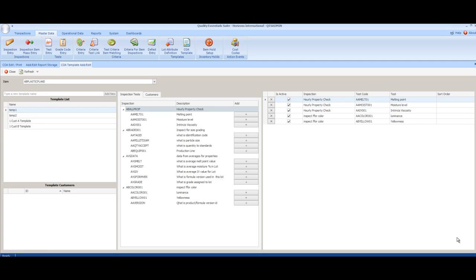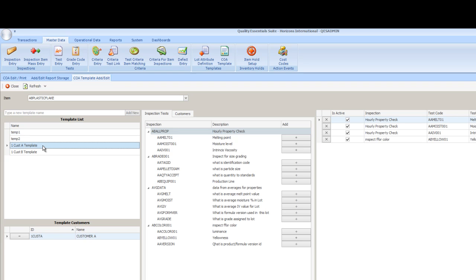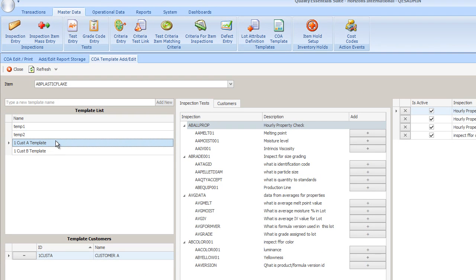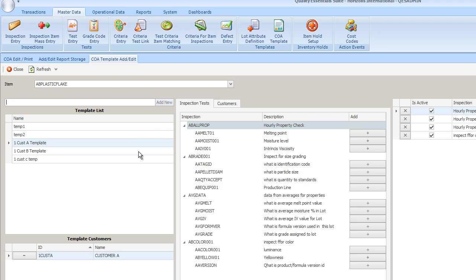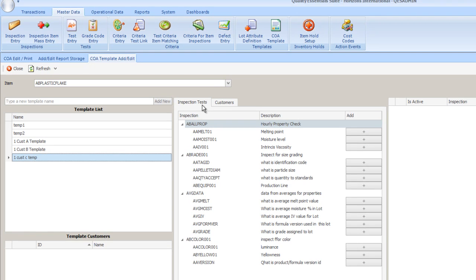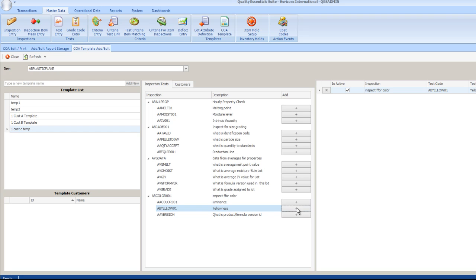To create COA templates, we use the COA template add edit form that is found in the Master Data tab in Quality Essential Suite. We begin by identifying the item number we wish to create the COA template for. You'll notice for our AB Plastic Flake, we currently have four templates that have already been created. If I select the template that's labeled for Customer A, we will also see in the lower left that Customer A has been assigned to this template. If I want to create a new template for Customer C, I'm going to create a customer name for the template. Then I'm going to add that template to our list of existing templates. When I click on that added template, my inspection test form in the center of the panel will be refreshed, and from that list I can select exactly the tests that Customer C wishes to have reported. Those would be the test for yellow that's found here at the bottom, and the test for moisture.